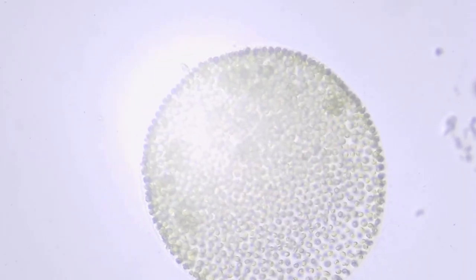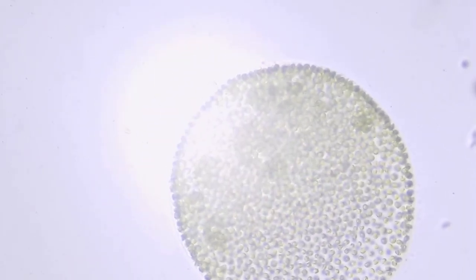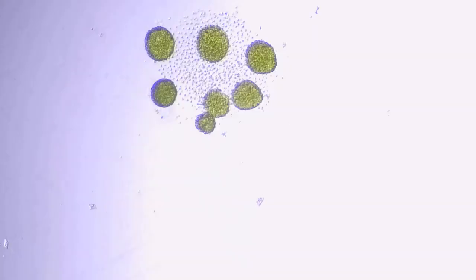Each colony is a hollow sphere made of 500 to 60,000 biflagellate cells. Cells are embedded in a gelatinous matrix and connected by cytoplasmic strands.